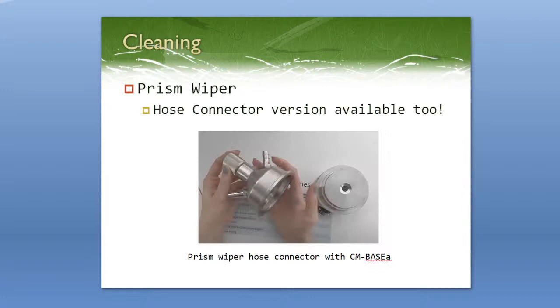Next we have the prism wiper in a hose connector version. This works really well because you can use it with the hose connector, which is a low-cost alternative to the pipeline fitting, and having the prism wiper on it too gives you a great little set. It works the same way as the fitting version — you clamp it to the refractometer, push it in, and turn it every time you want to clean it so you don't have to take everything apart.